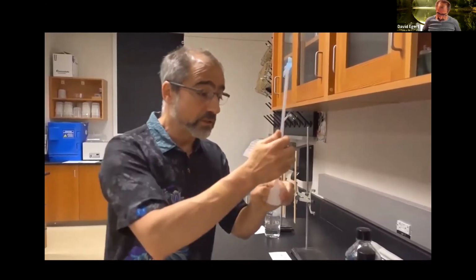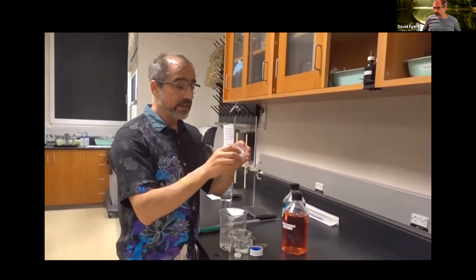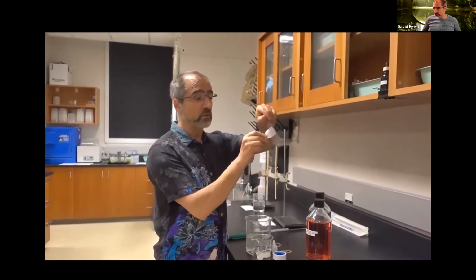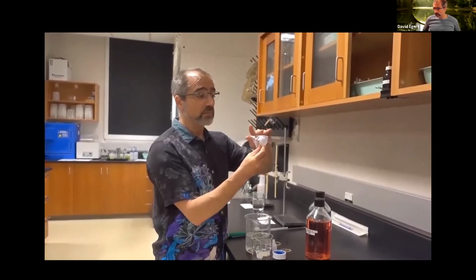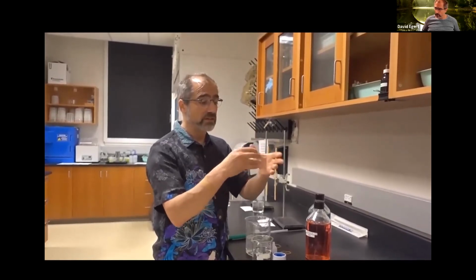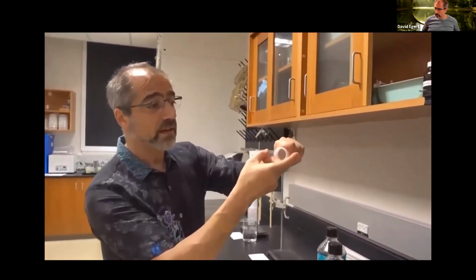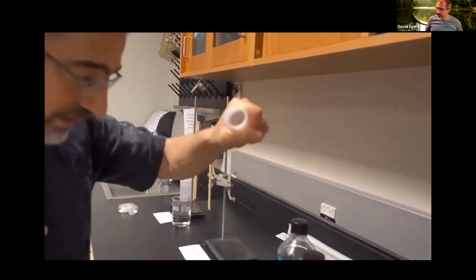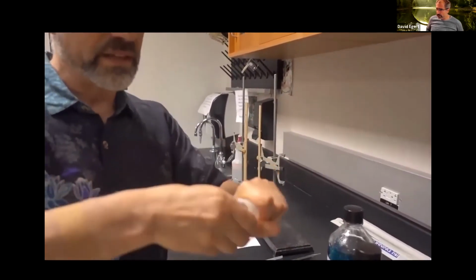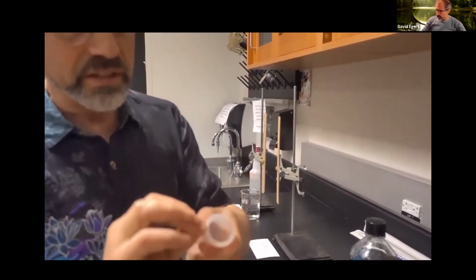So I'm going to put this thing together. I take my tube. I need to really seal this dialysis membrane really tight because I want to make sure any water that comes in is going across here and nothing leaks out. I'm going to pull it really tight like a drum head. Boom, boom, boom, boom, boom. And I'm going to use not one, but a few rubber bands. As this experiment proceeds, the pressures actually get pretty intense.